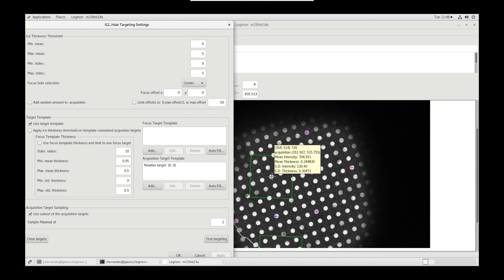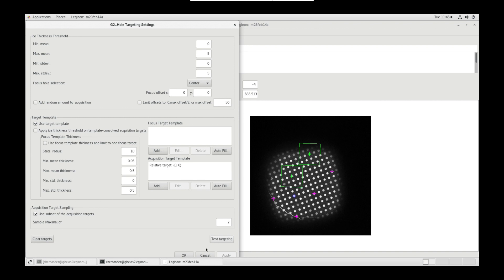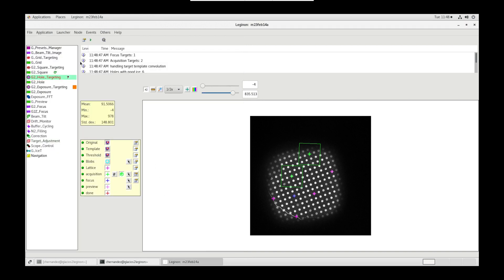You can hover over targets and use their mean thickness and standard deviation thickness to threshold your targets. Be wary, as each grid will have different values and you may threshold out all targets in the future, so be loose with the range. Click test targeting to randomize the targets, click OK and submit targets.